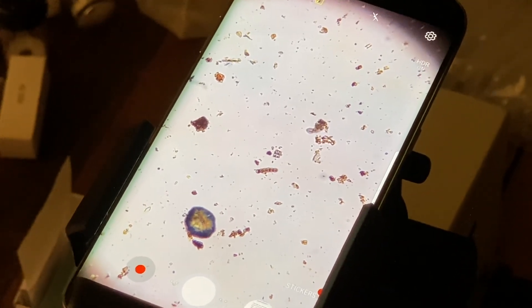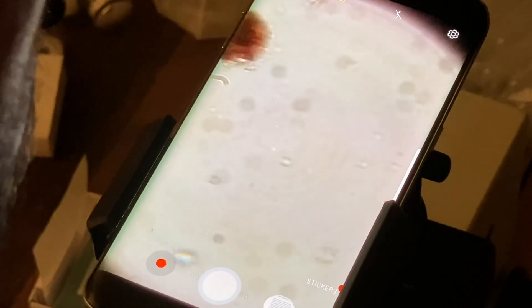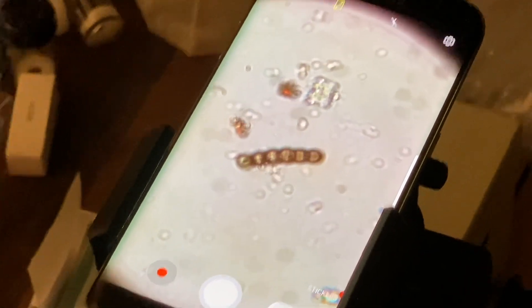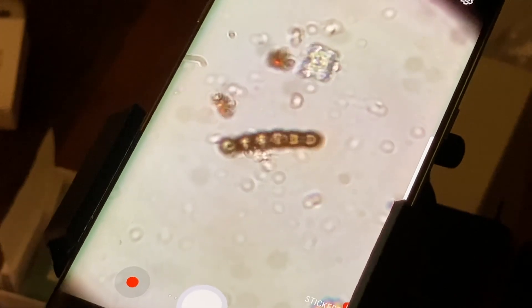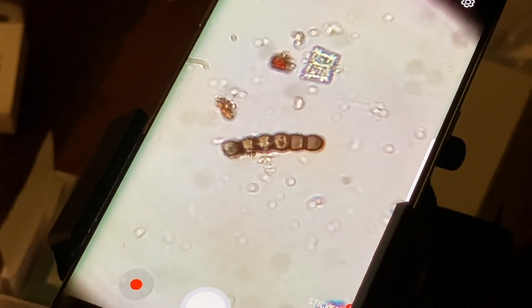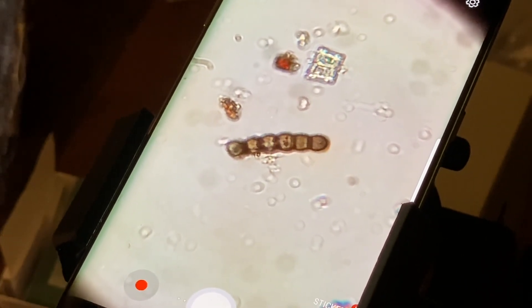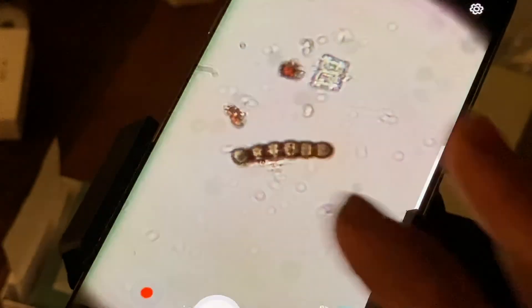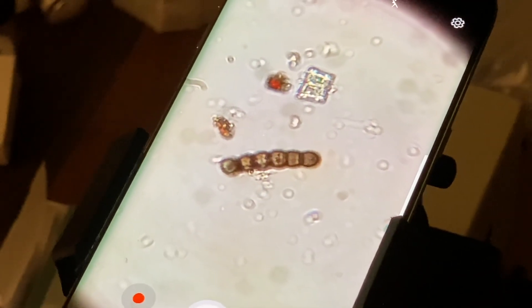Some sort of multi-celled organism here. Just a chain of cocci? No, it's a little big for that — I don't know what that is. I'll snap a picture and find out what that is later.